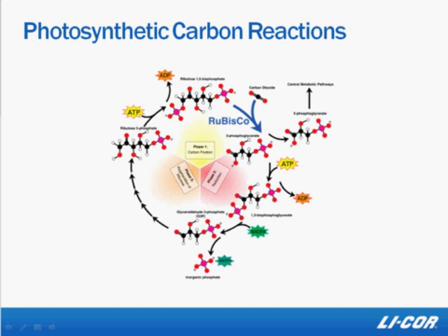When we do a CO2 response curve, which you'll also see referred to as an ACI curve, we're looking at the other half of the photosynthetic mechanisms in the leaf. Rather than looking at the light reactions, now we're looking at the carbon reactions. And this image shows the carbon reactions called the Calvin cycle, or Calvin-Benson-Bassham cycle, or reductive pentose phosphate cycle, and of course the other PCR.